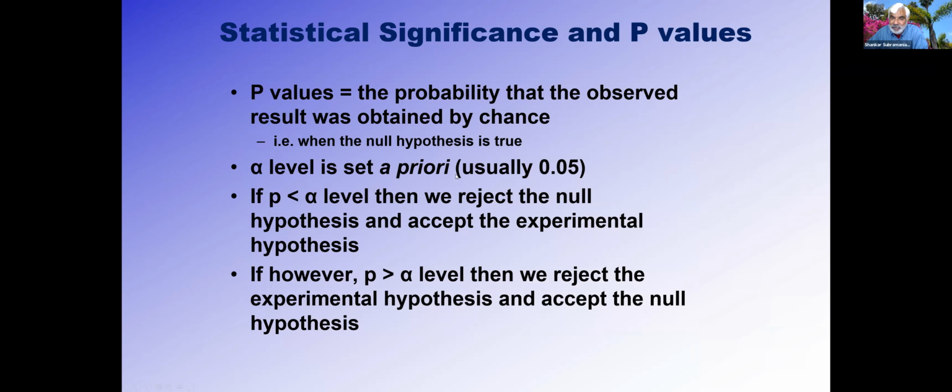Usually you set the probability value, the p-value, to be less than 0.05, or 0.01 if you want to be more stringent. Sometimes you want to be even more stringent, 0.001. Make sure of multiple testing correction, which means that if you have a large number of samples, you want to make sure you normalize with reference to that. So, as a consequence of that, you do something called a false discovery rate. I'll show you more as we go along.